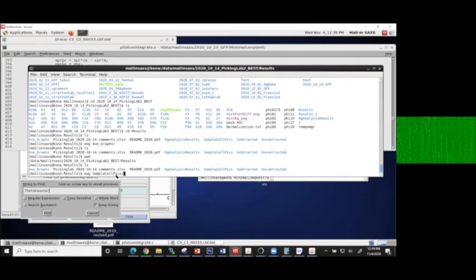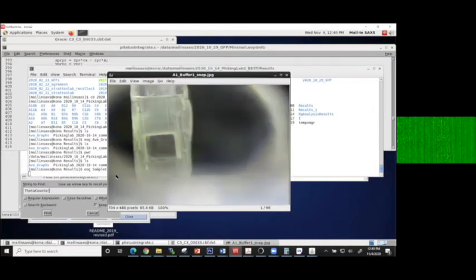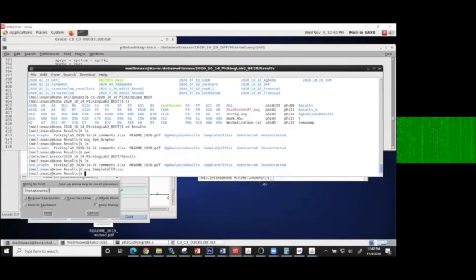And so this is our needle, which has picked up your sample and transported the sample to the X-ray beam. That square box is the liquid, your sample liquid, and X-rays are being shot through that. Sometimes you can look through here quickly, and I'm moving through them, and you'll see bubbles or variations. Like there's a bubble right there for B6 that would explain some phenomenon that you might be seeing. And you can look at a gallery view of this as well. So that's one thing you have in there.